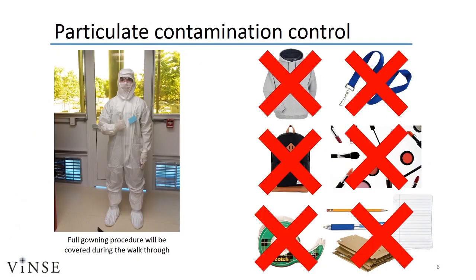To avoid contaminating the space, users wear clean room garments that contain their environment and debris. This gowning procedure, which will be covered in the facility walkthrough, includes a hairnet and face mask, a hood, coveralls that extend from the neck to the ankles and wrists, two pairs of shoe coverings, two pairs of gloves, and safety goggles. To avoid separation between the hood and the coverall, hooded sweatshirts are not to be worn in the clean room. External items, such as lanyards and backpacks, are not permitted in the clean room, nor is excessive makeup or fragrances such as perfume or cologne, as these will generate further particulate matter.